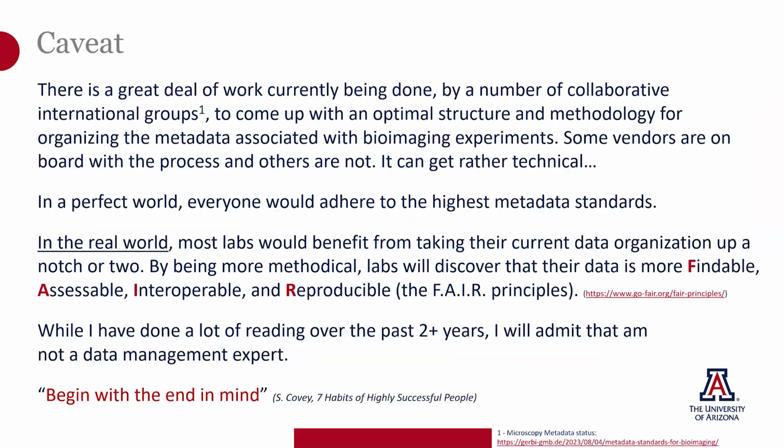There's a great deal of work being done by a number of different international groups to come up with a structure and methodology that's the best way of organizing the metadata that's associated with bioimaging experiments. Some vendors are on board with the process, and unfortunately, others aren't. And the details related to image metadata can get quite technical.